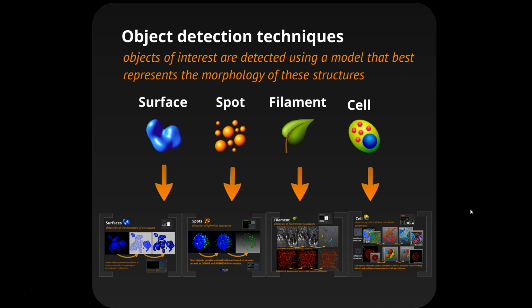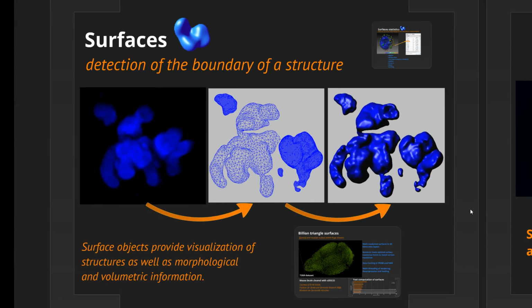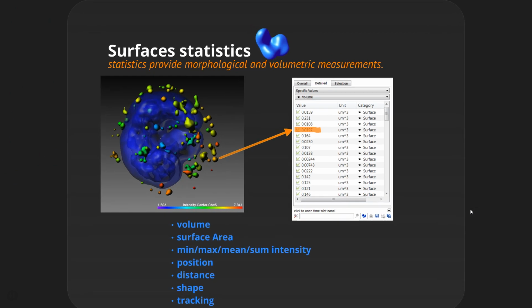The one thing that's always tricky for us from a development standpoint is actually getting data and putting it through its paces. We have a really good working relationship with multiple labs globally that give us data, but it pretty much is just them giving us data, so it's not a broad realm of data sets. Janelia Research Campus is one place that we do a lot of collaborative work with. But if you have data and you want to push the limits, I can set you up with a demo license and you can give it a whirl.